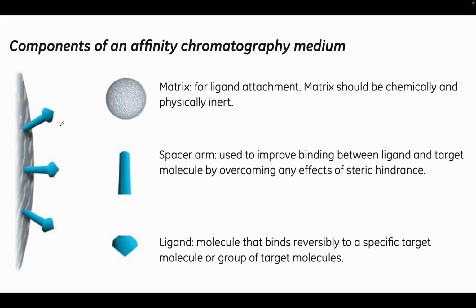Okay. So, coming back to chromatography, how can we make a column for the purpose that we want? Say I know I have a protein and I know it has a binding partner. There's some ligand I can use for affinity. Then how can I go about setting up this experiment?